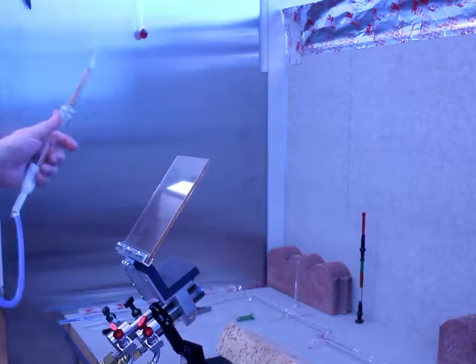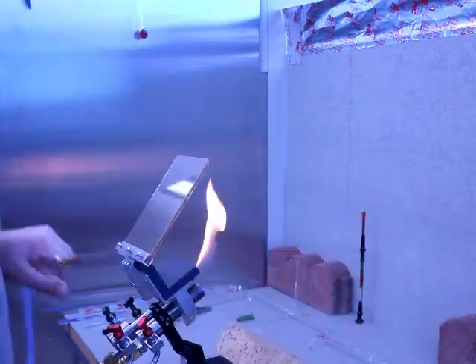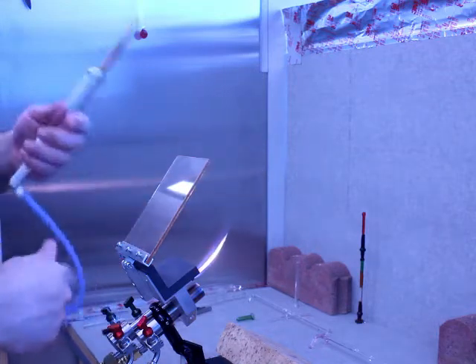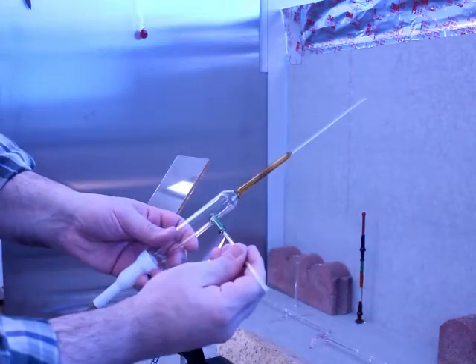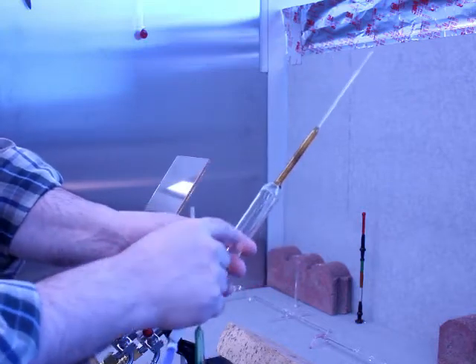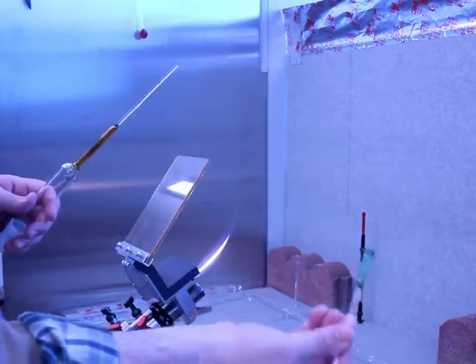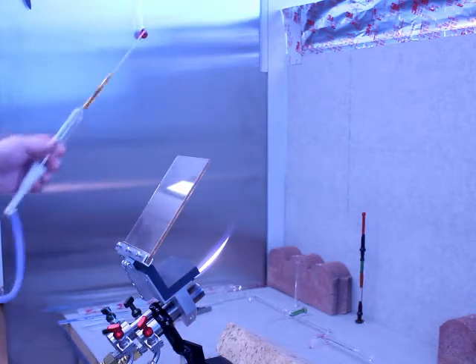I've changed the position of the camera to be a little further away, and the purpose of that is so you can see what I'm doing as far as making the bridge. Now, first, before I can make the bridge, I need to make a side seal, which will be the outlet for the bubbler. So argon or nitrogen comes in this way, bubbles through, I don't have the ring seal in, and then it exits through here. Right now, both of these tubes are closed, but I'm going to open them up eventually. And this is also puntied up with a hot seal, so that way it's easier for me to handle it.